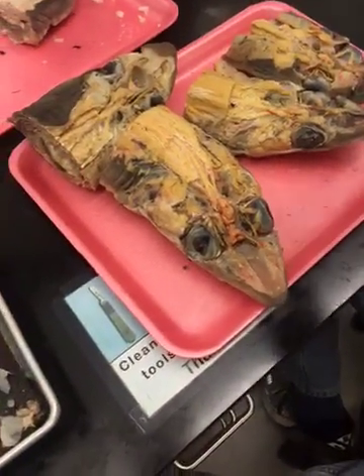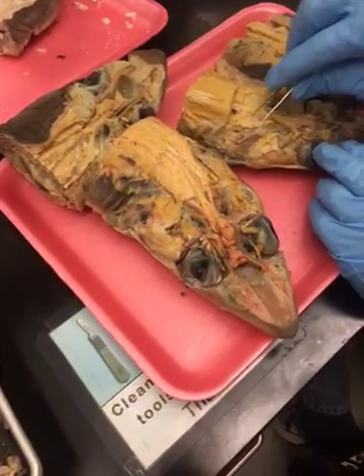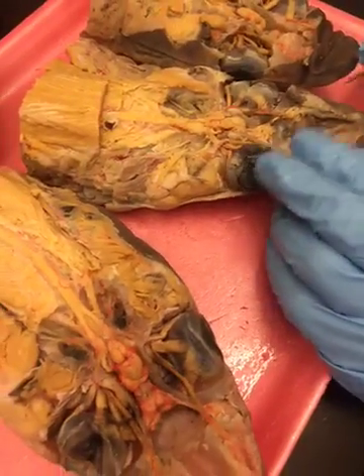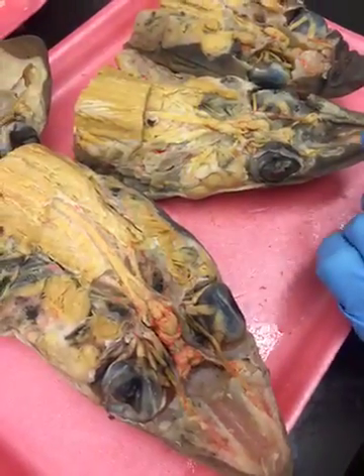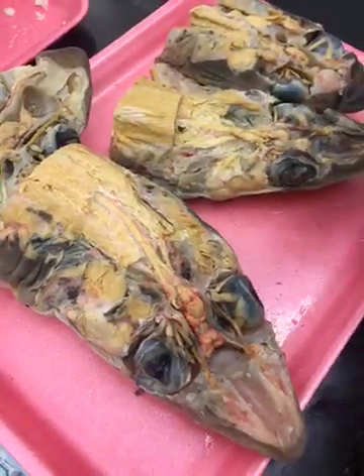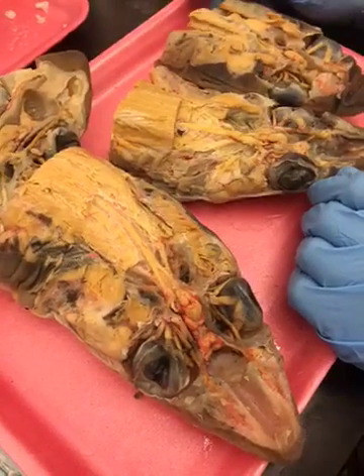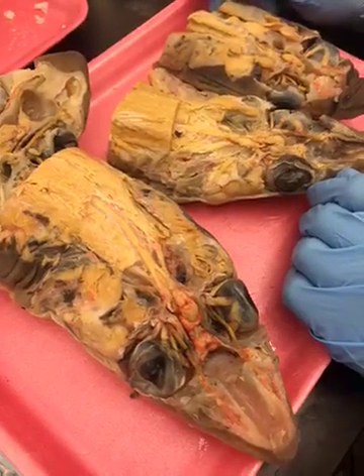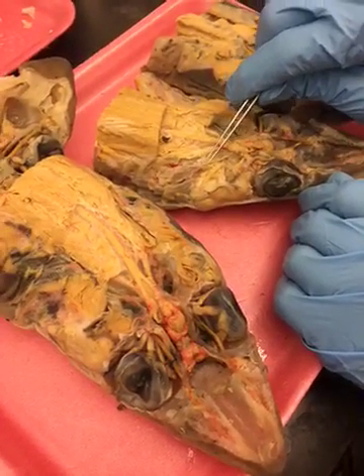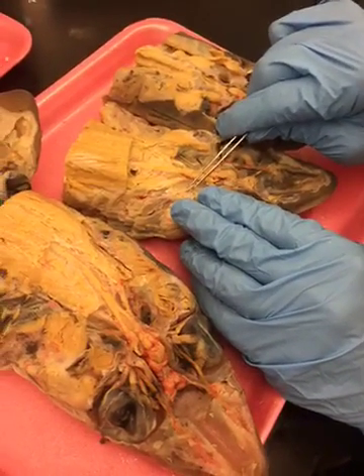If 7 runs behind the spiracle, the first half gill, 9 runs to the first full gill. There's the first full gill, and there is 9. A glossopharyngeal. Now, in humans, it's called the glossopharyngeal because glosso means tongue. Now, this nerve is running to a gill. In what sense is it running to the tongue and the pharynx? It ain't. It is in us, but its homologue in the shark is going to the first gill. That's the glossopharyngeal nerve, nerve 9.